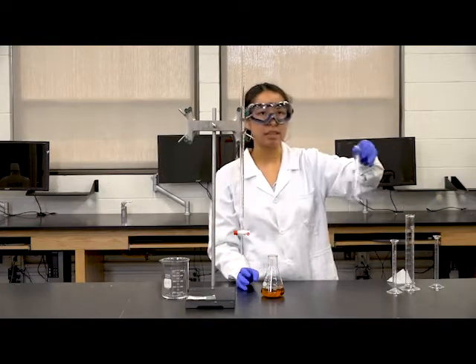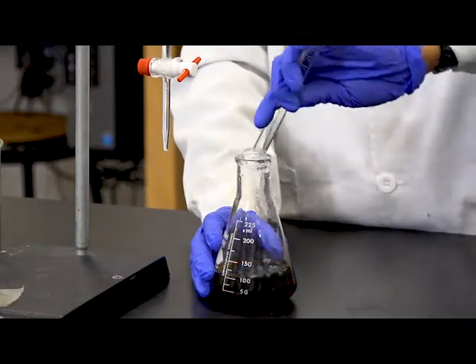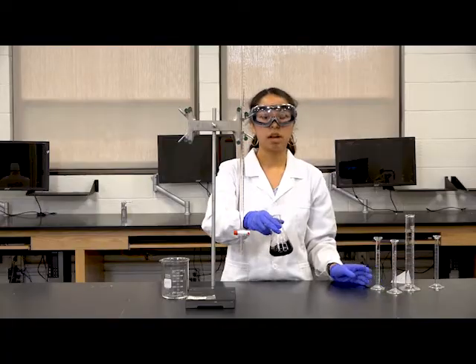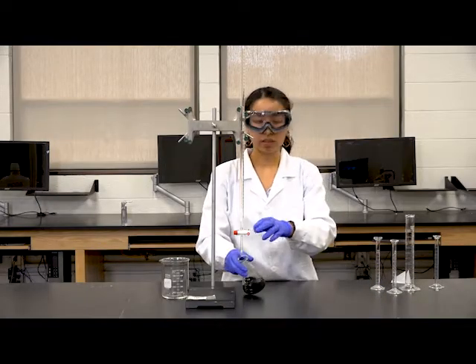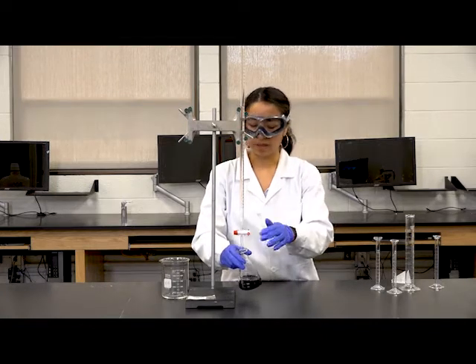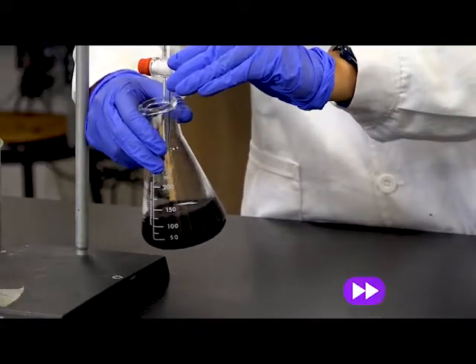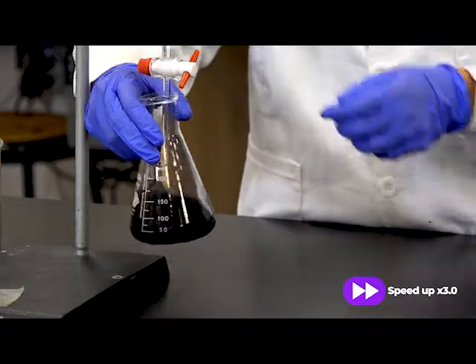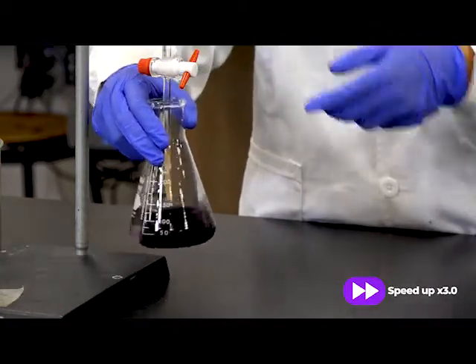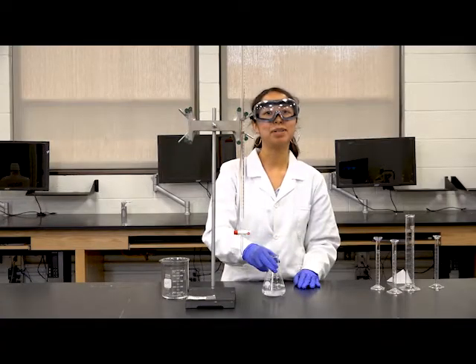After that, you're going to add the starch indicator into the titrated solution, and your solution should turn a dark blue-black color. After you mix it well, start the titration again, and remember to do it slowly because the change is going to happen really fast. So you're going to go from this color into a colorless solution. You did a titration.